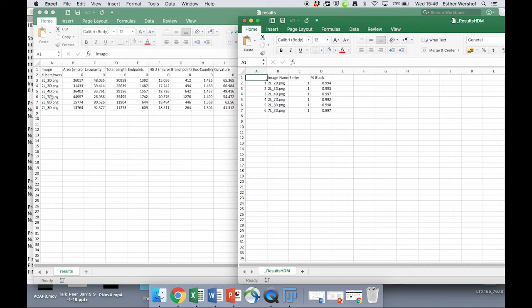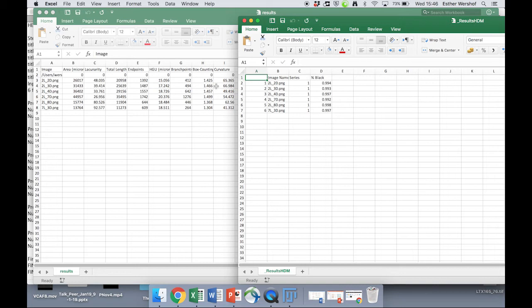So we have each file name and information on each of the metrics described in the documentation and in the manuscript. And with these metrics, we can then start to do things like regression analysis and start to compare quantification between matrix patterns.